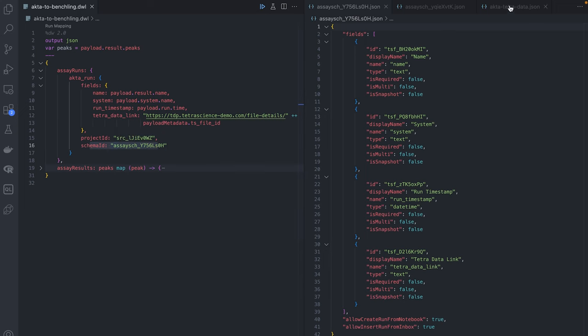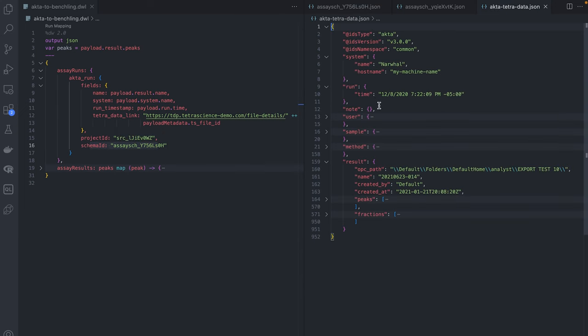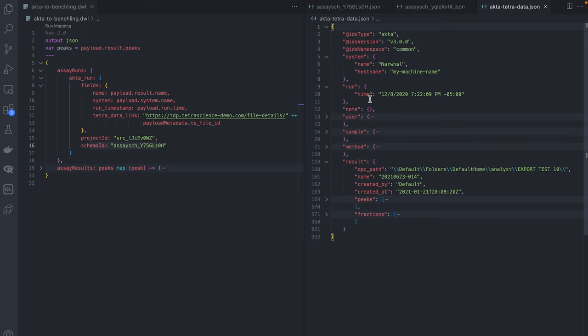As we jump over to our Tetra data, you can see that we extract the result name, the system name, and the run timestamp from the Tetra data. I've also added a link to the file in the Tetra data platform for easy access.